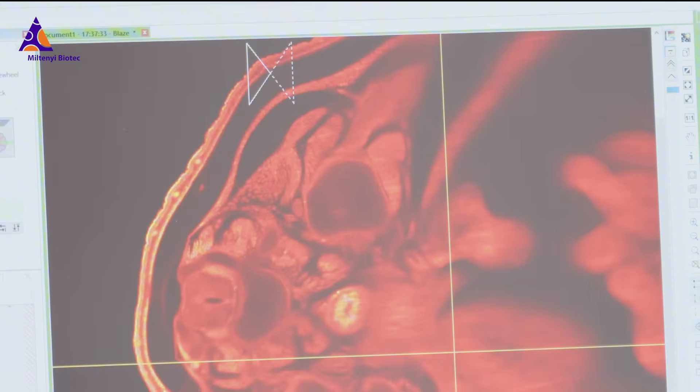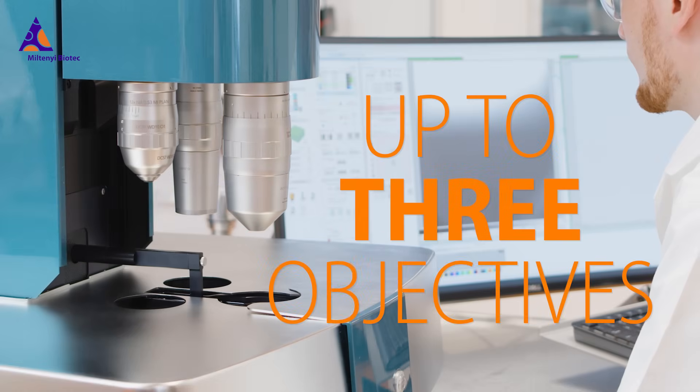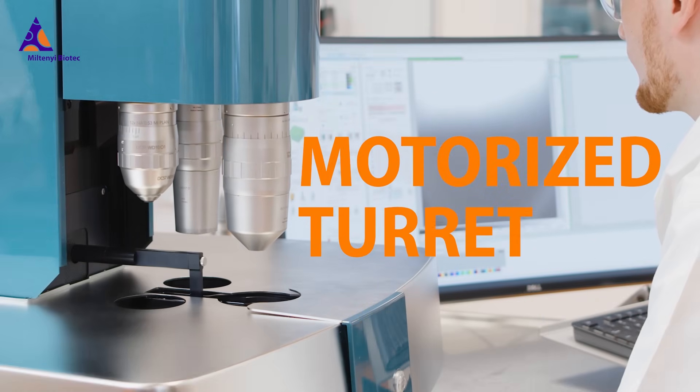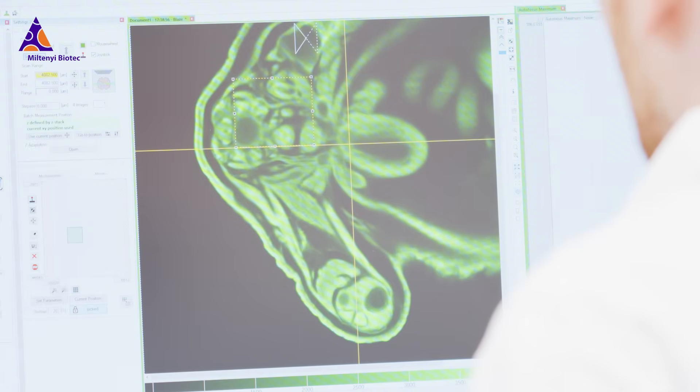The Ultra Microscope Blaze is the only light sheet instrument that can hold up to three objectives. A motorized turret allows fully automated switching of the lenses and enables you to get an overview of the sample and then analyze sub-cellular details without manual handling.